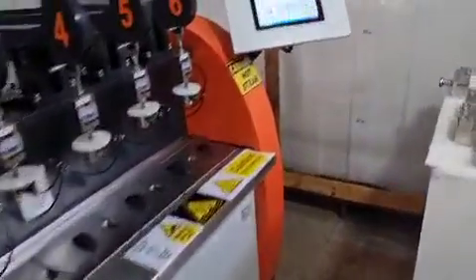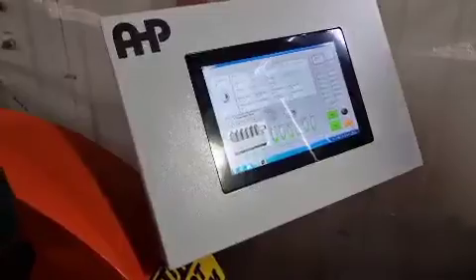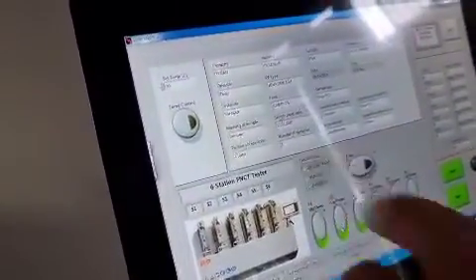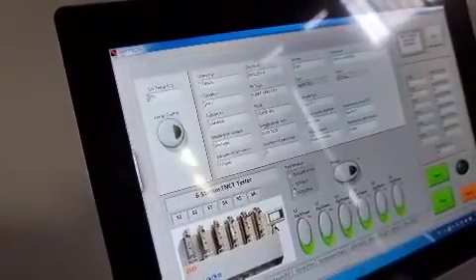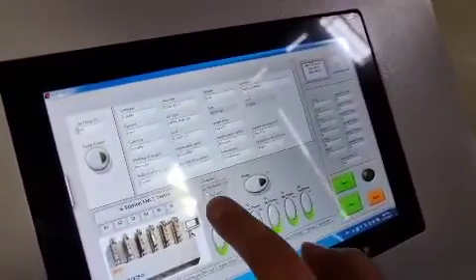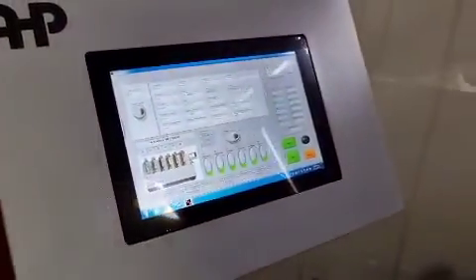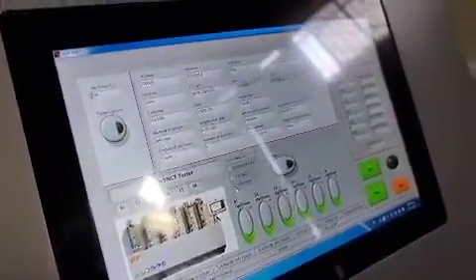Here, you first need to choose according to which standard you are going to do the test — DVS or ISO. Let's see what will be available in the software. According to DVS, please choose DVS 2203 — the third one.